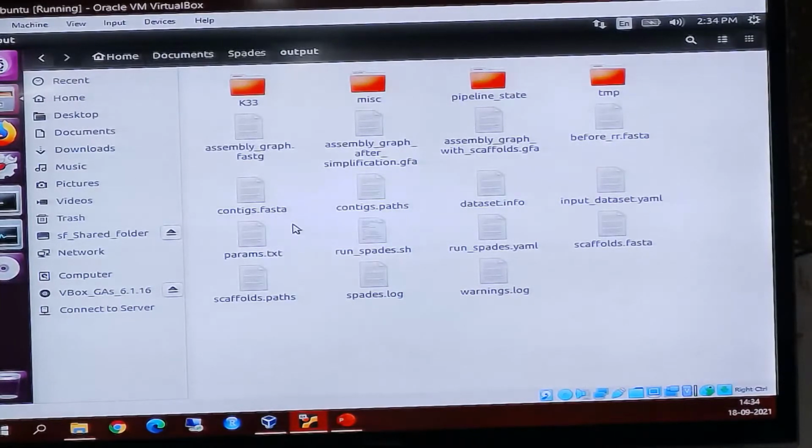In your computational system, it will take more time, but it will do. If you are having a high-end system, it will do. That is for sure. I am having a lot of files. Assembly over. The second one, now run the files generated in the output folder.